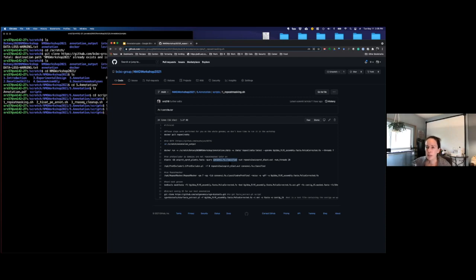But the problem is that sometimes you'll have protein domains, and those can be rather high copy number as well. So the prediction might call things that are legitimate proteins repetitive elements. And then whenever you mask your genome, all those sequences are going to be masked. So whenever you try to do the annotation, you're going to have proteins that are missing probably pretty important parts for their function. So you don't want that. So that's what these next two steps are about.